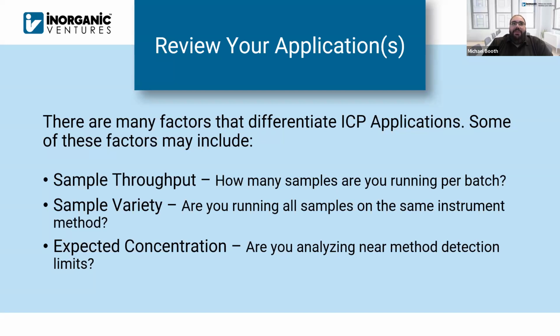And when you think about these factors you have to review for your application, there are also factors that you should review in terms of just your laboratory as well, that go beyond the individual method. And that could be the overall cleanliness of the lab. Sometimes if you're doing large dilution factors, there are contamination risks, and we'll talk again about that more in a second.